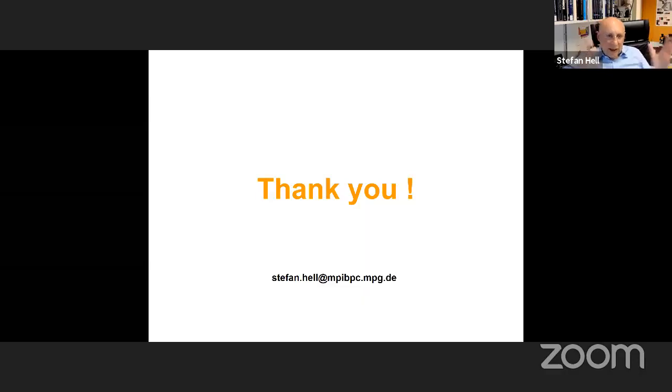But here, for fundamental reasons, you do the majority of the localization with the photons that come from the laser, and that of course gives you a lot of precision to start with. And this is really a major benefit.